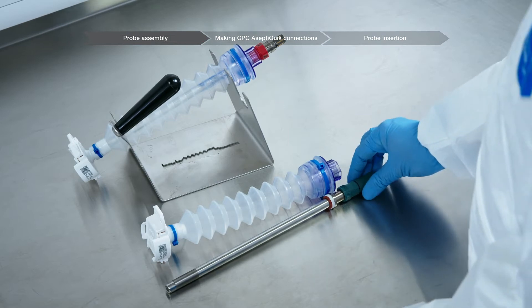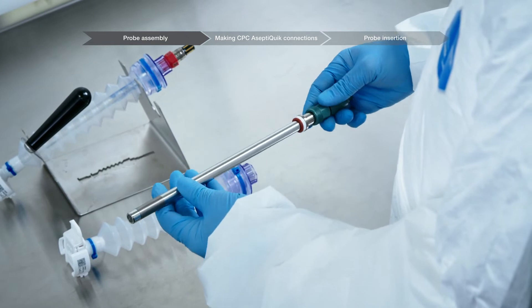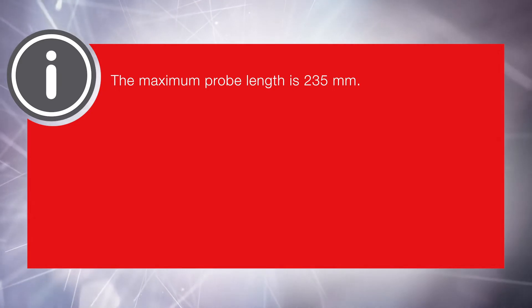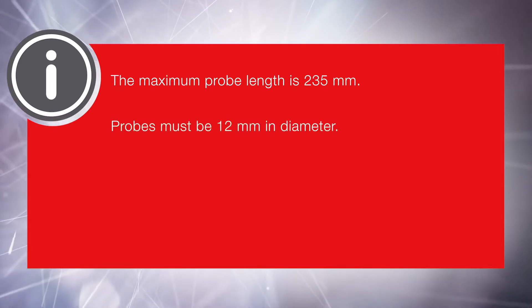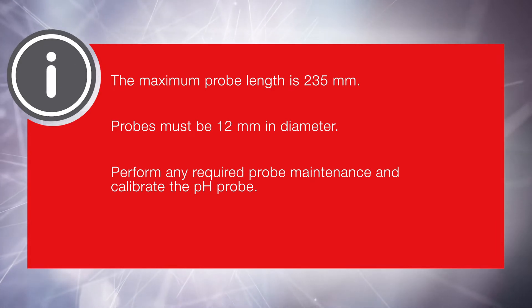Select an appropriate probe, verify the presence of a Teflon support ring and O-ring, and visually inspect the probe for damage. The maximum probe length is 235 millimeters. Probes must be 12 millimeters in diameter. Perform any required probe maintenance and calibrate the pH probe.